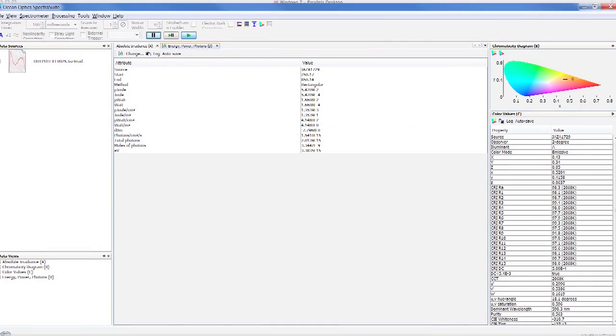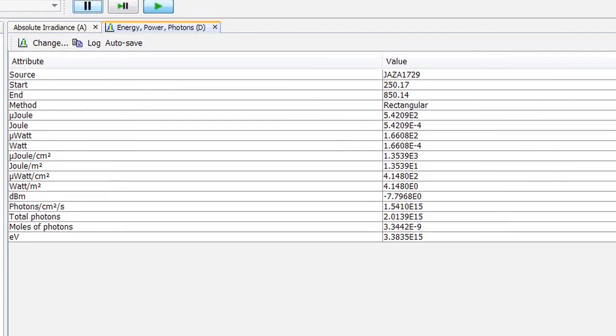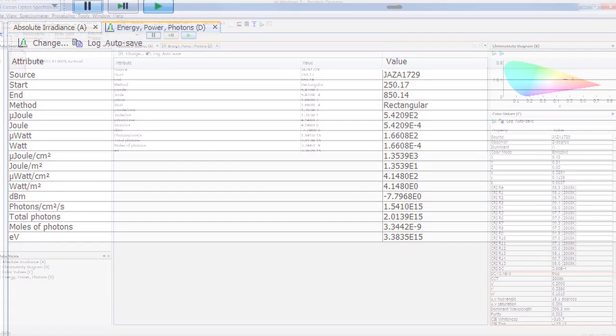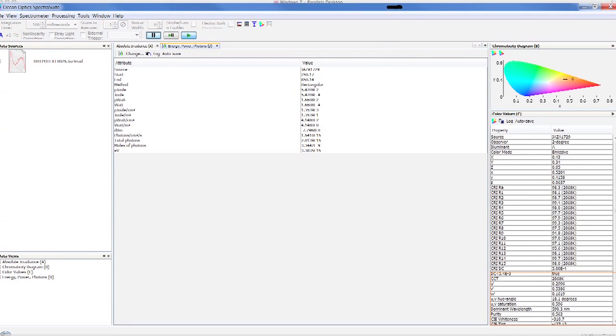Now the Energy, Power, Photons post-processing box will appear. We will move this box to the right as well.